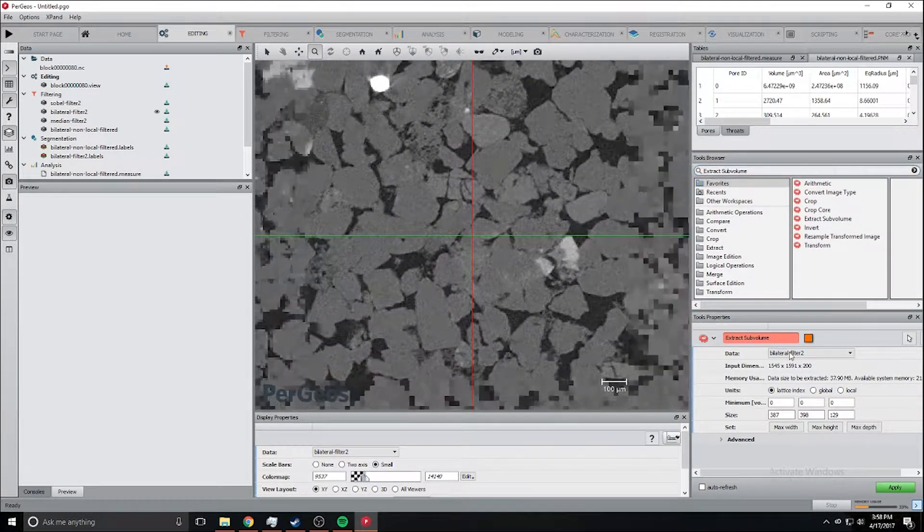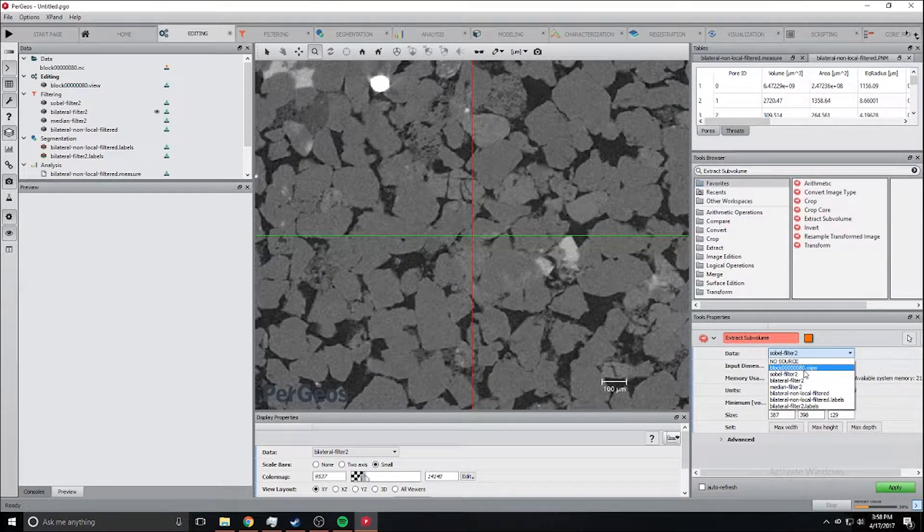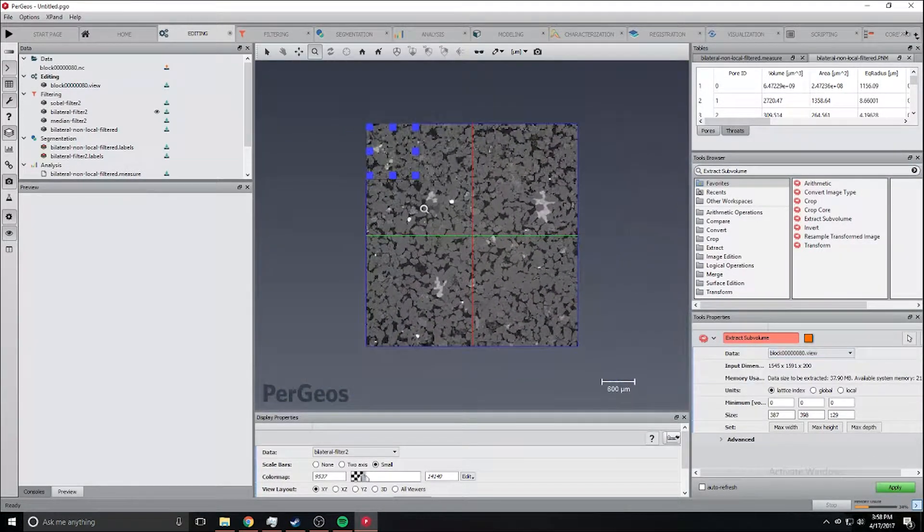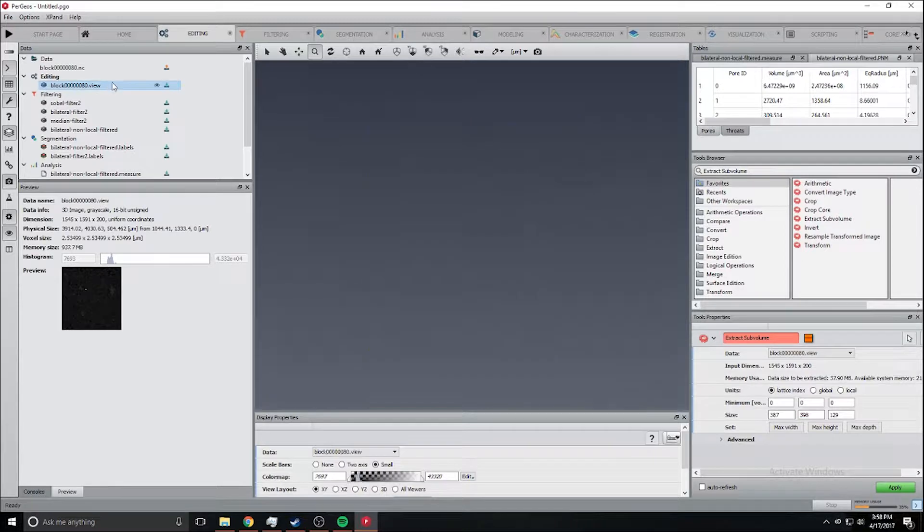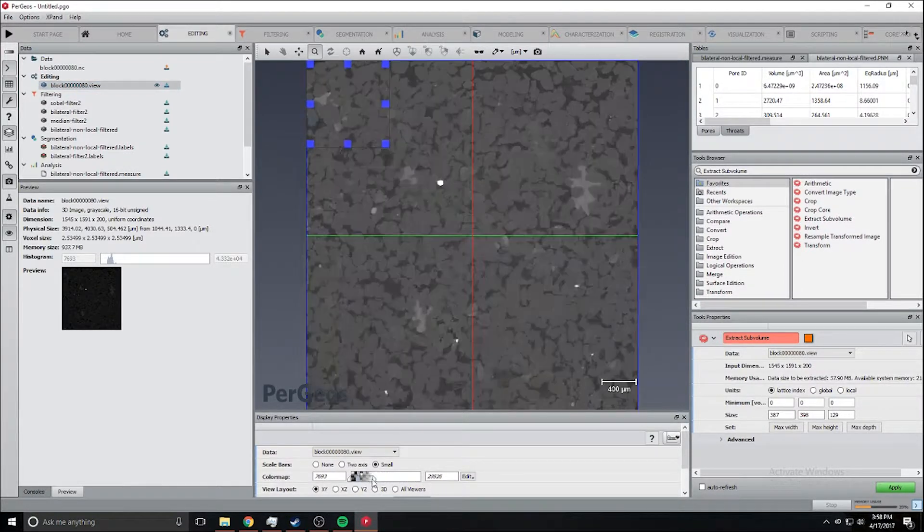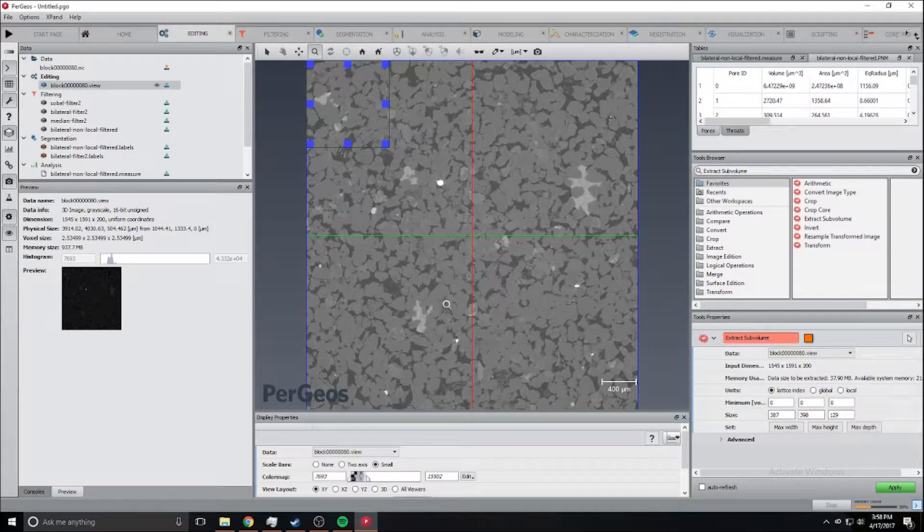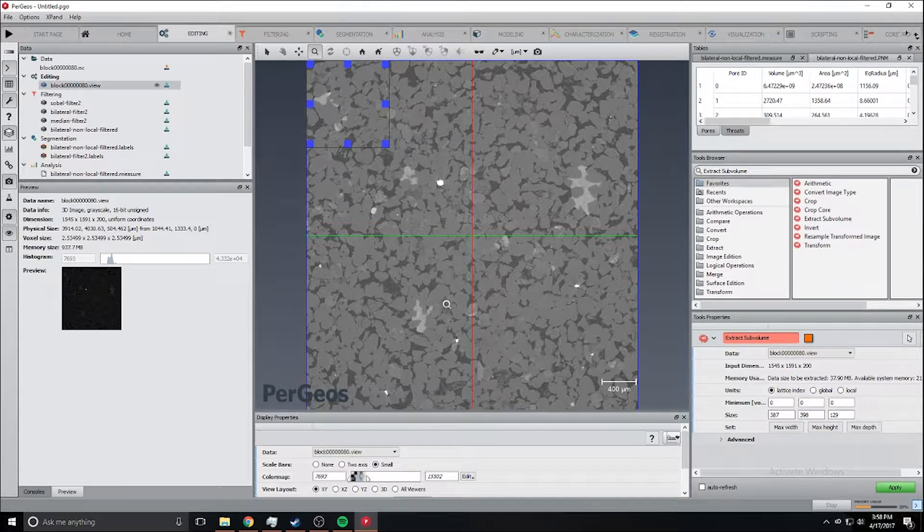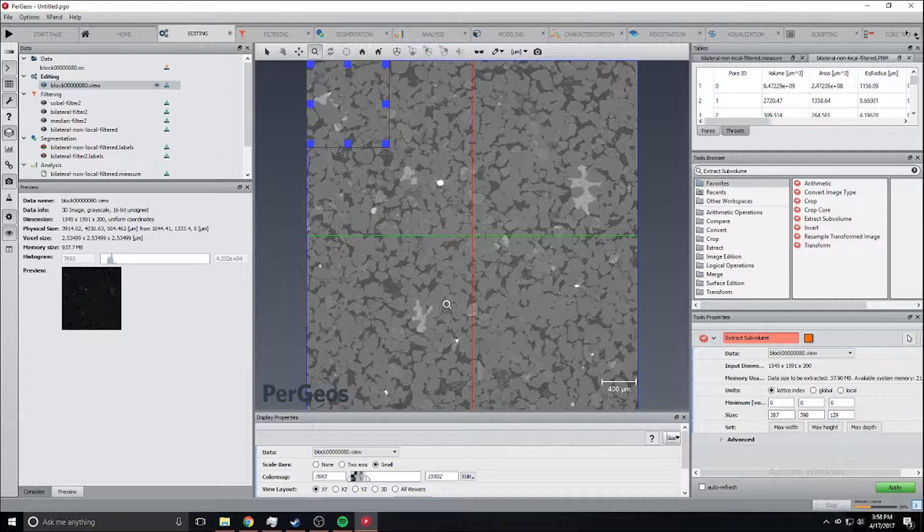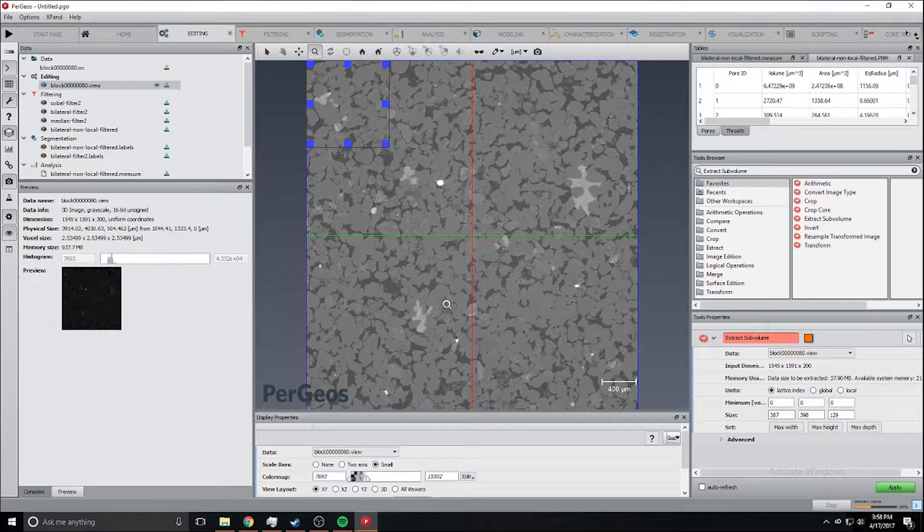Instead of loading it and doing it, I've already loaded and extracted a small subvolume just for speed. This is the image set subplug. We're going to take it and apply some filters onto it and then we'll see where we are.